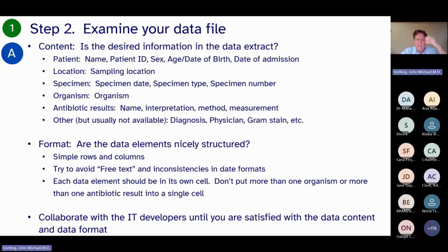It's just not realistic. There are a few places where they download 98% of the data, and then they manually type in additional information, and you can also do that. So you download the LIS data, and I've seen people use this, for example, for the freezer number. Where did we store that sample? Sometimes for blood cultures, they'll save it. So they will go to WHONET and manually type the freezer number, the box number, so they can retrieve it later. So that's a hybrid approach. You're downloading everything you can, and then you can manually edit and add additional details. Okay. So that's the data content.